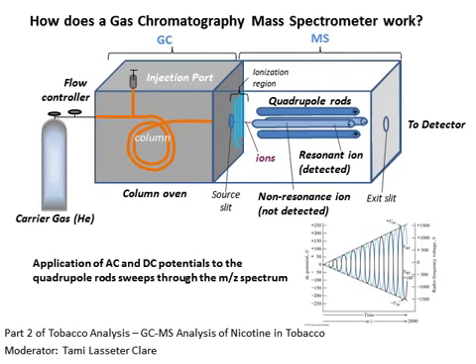Because the cationic parent and daughter ions are charged, their trajectory through the mass spectrometer can be manipulated by external electromagnetic fields. That's the purpose of the 4 metal rods that make up the quadrupole mass analyzer. Both AC and DC electric fields are applied to the rods in such a way that only a few ions can precisely waver through the electromagnetic gauntlet that they are exposed to.